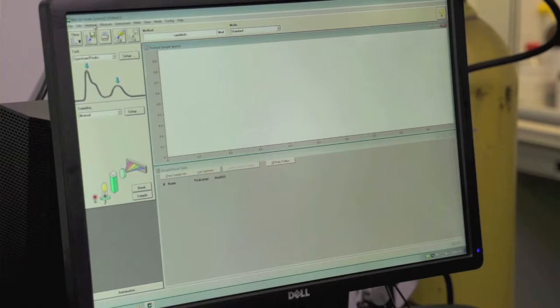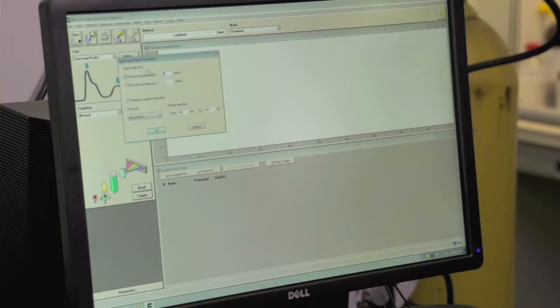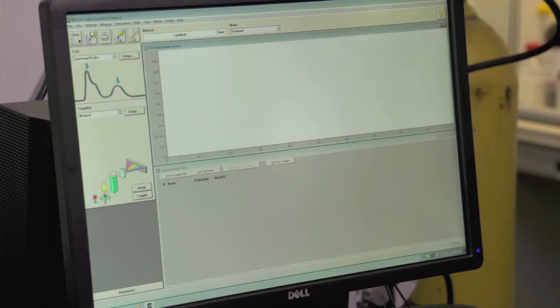You'll need to change the settings in order to investigate the relevant spectral region for the quantum dots. In order to do this, go to method, setup analysis, and you'll be looking at one peak in this case. So change it to one peak on the find and annotate up to one peak portion. Also, for the display spectrum, you'll want to change that to be from 200 nanometers to 400 nanometers. Click OK. Now the instrument is properly set up within the software to collect the data.